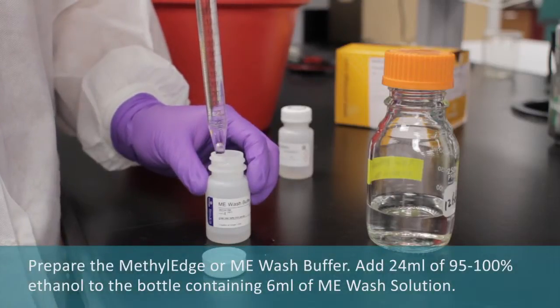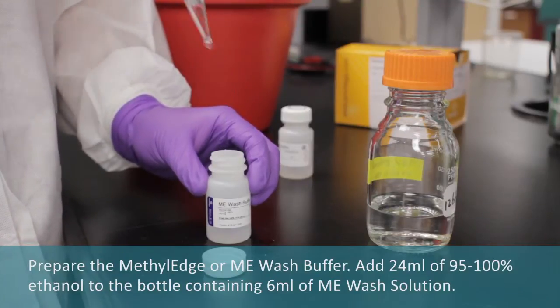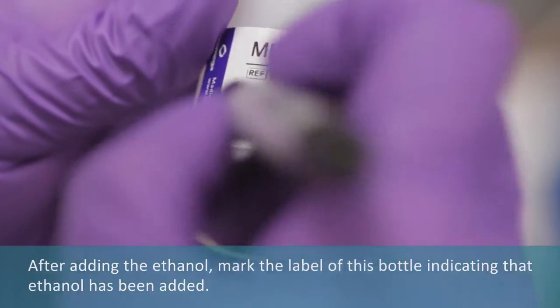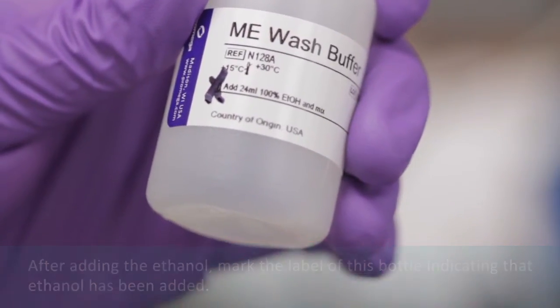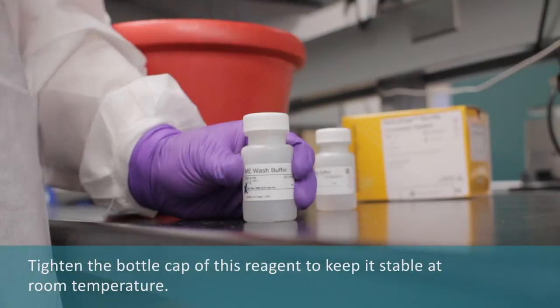Prepare the ME wash buffer. Add 24 mL of 95 to 100% ethanol to the bottle containing 6 mL of ME wash solution. After adding the ethanol, mark the label of the ME wash buffer indicating that ethanol has been added. Tighten the bottle cap to keep the wash buffer stable at room temperature.